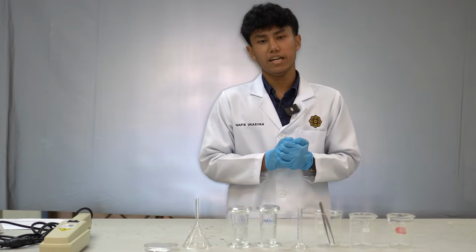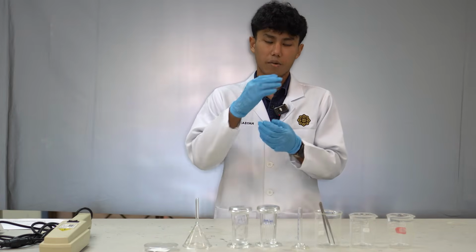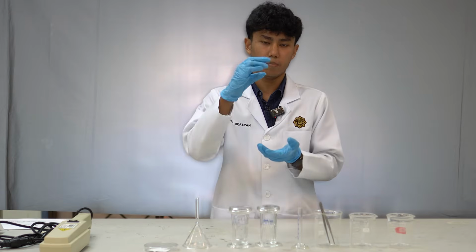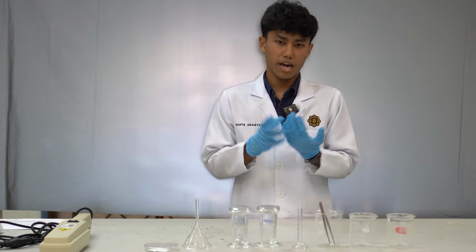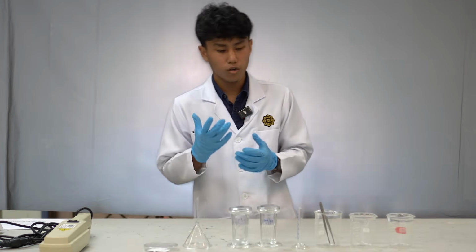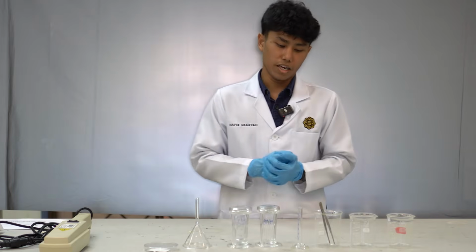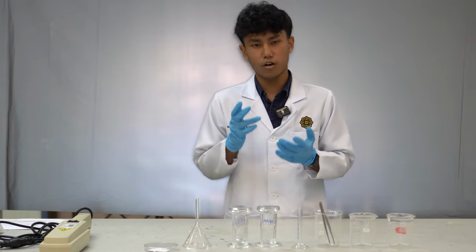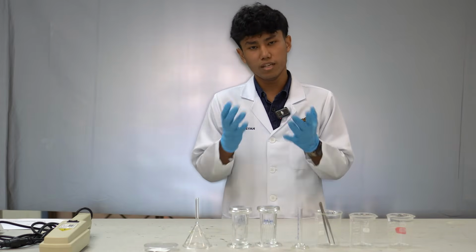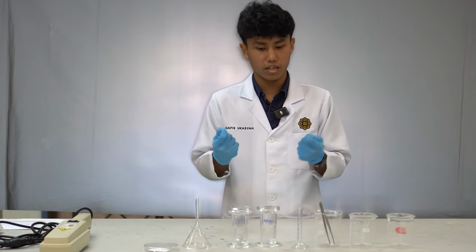After that, we must not touch the baseline and the solvent front, or the space between them, with our hands, because our hands have impurities that can affect our sample too. Next, when we deal with UV light, UV light is dangerous for us. How do we deal with UV light?